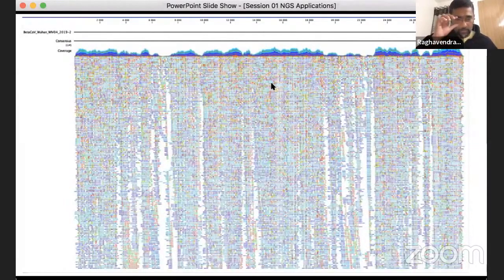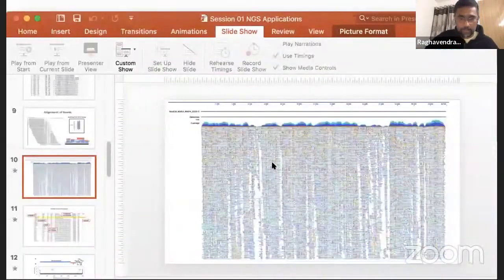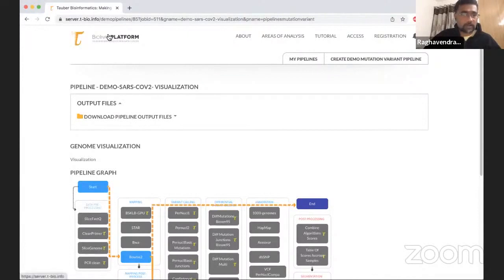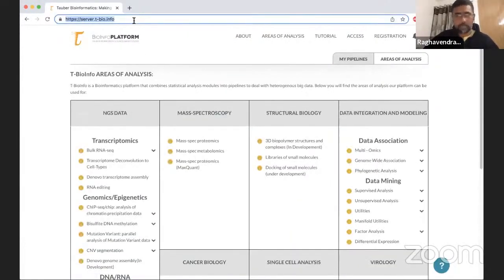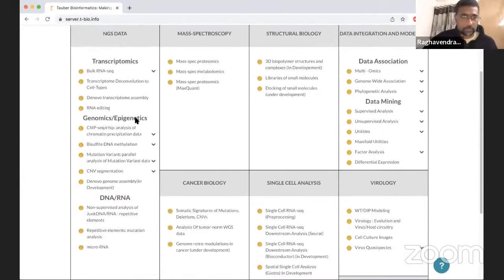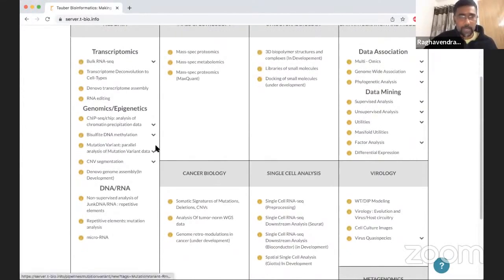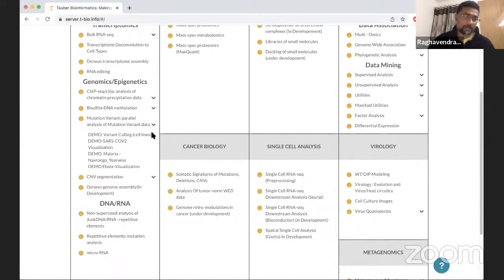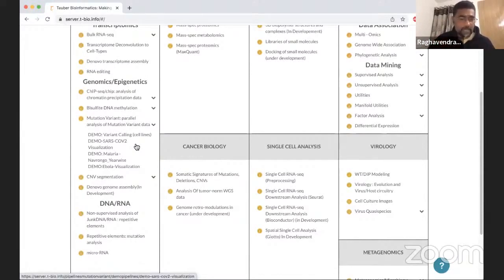Let me quickly go to the Tauber BioInfo platform and show you how to run a simple visualization pipeline for a viral genome. If you go to genomics analysis and then under mutation variant and parallel analysis of mutation variant data, you can drop down. We have prepared some demo pipelines which will give you the feeling of running these analyses and building up this pipeline for sequence analysis.